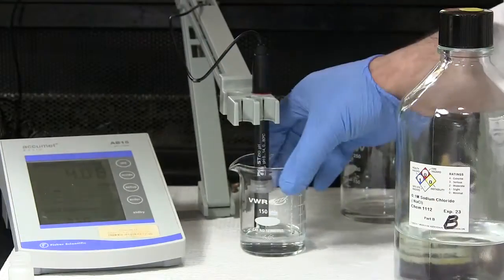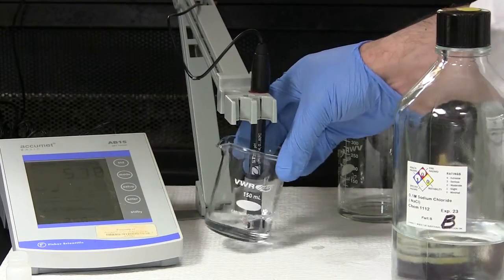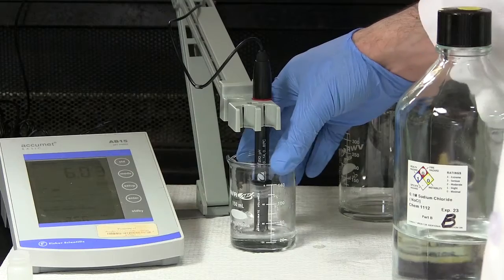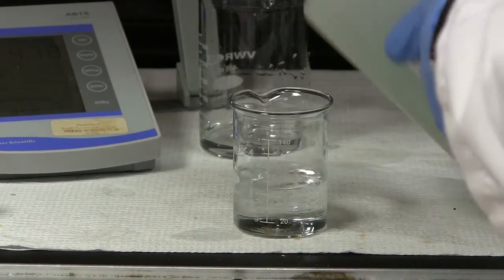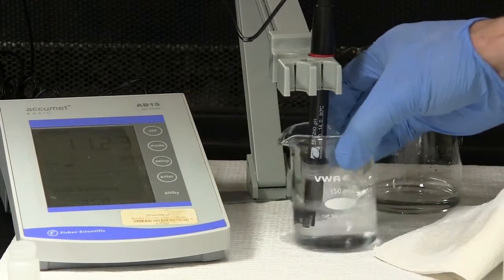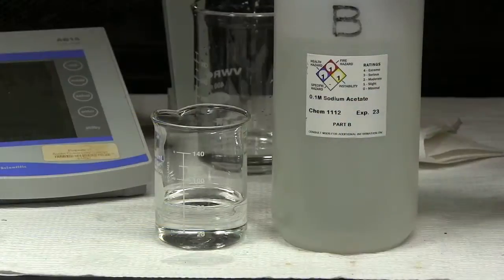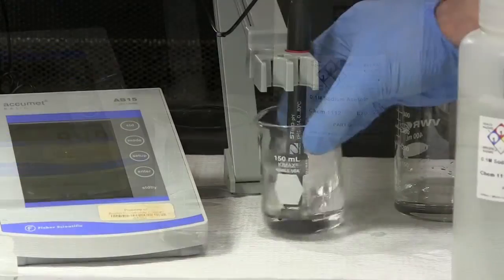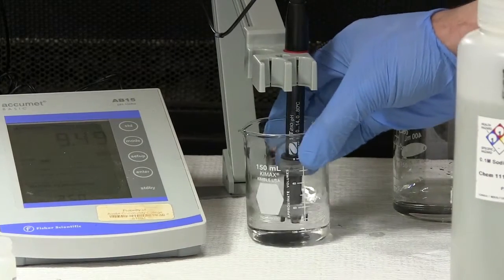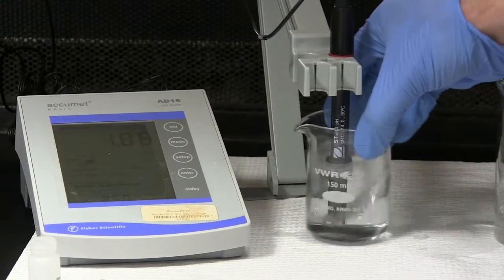Using a 25 milliliter sample in a 150 milliliter beaker, measure and record the pH of a 0.1 molar solution of each of the following substances: sodium chloride, sodium carbonate, sodium acetate, and sodium bisulfate. Rinse the electrode probe in distilled water between measurements.